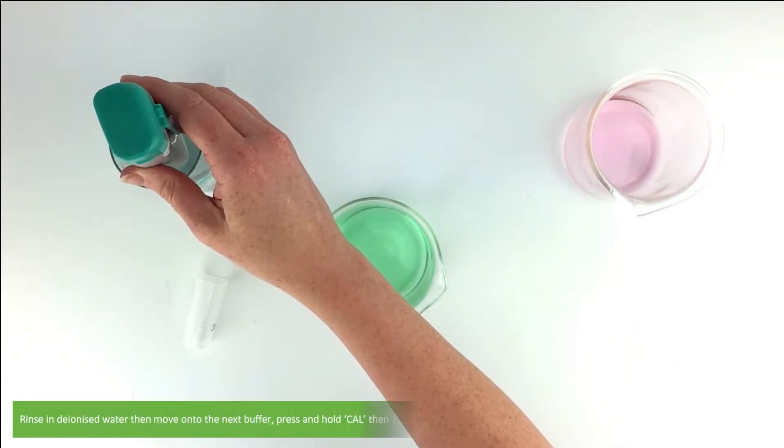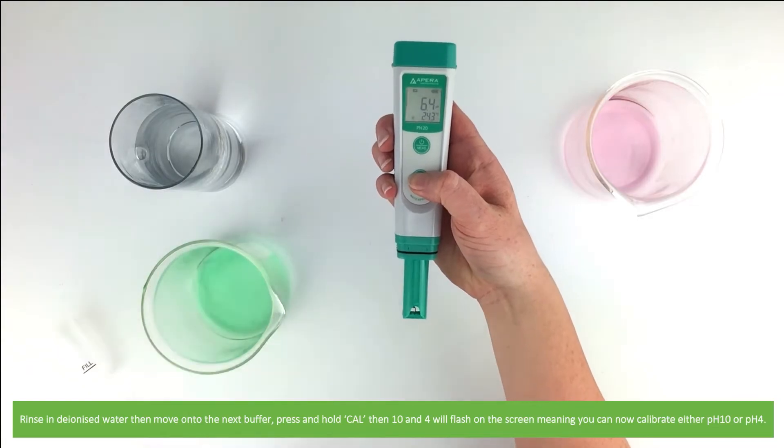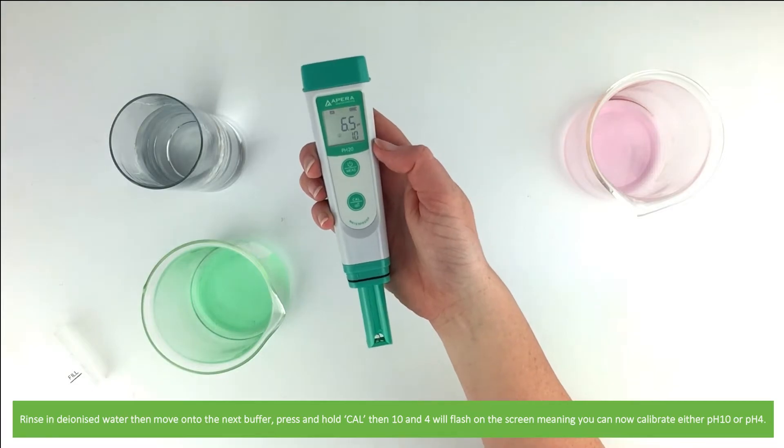Rinse in deionized water and then move on to the next buffer. Press and hold Cal, then pH10 and pH4 will flash on the screen, meaning you can now calibrate either pH10 or pH4.